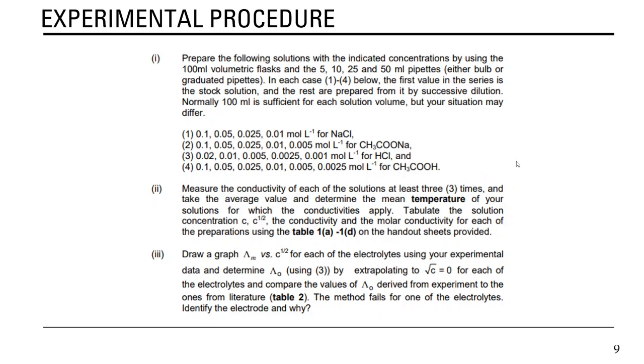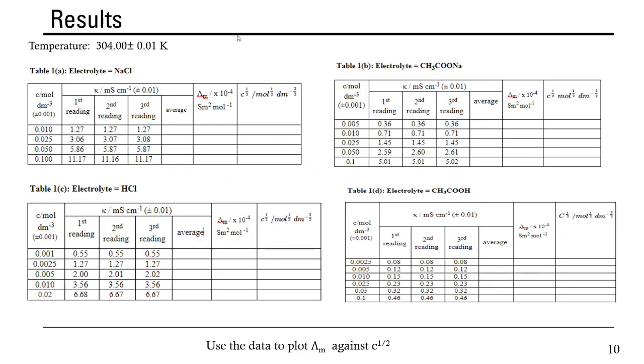Okay, and so here are the data by a pair of students. The temperature is conducted at this temperature.